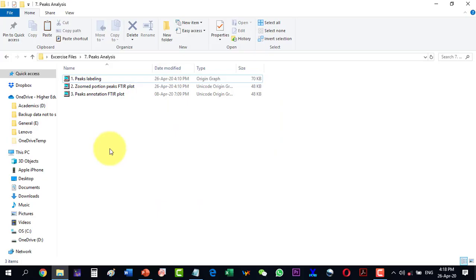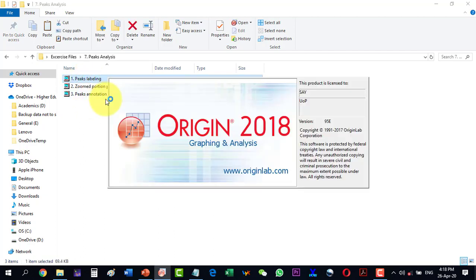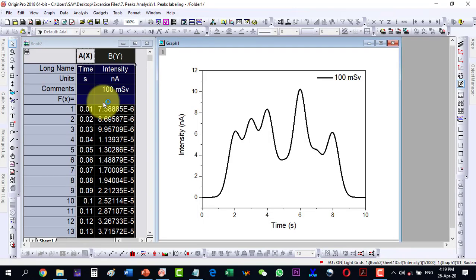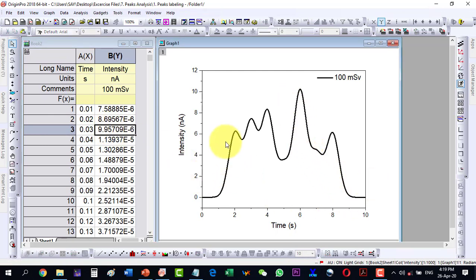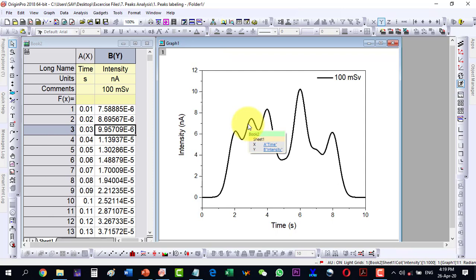In this video we will talk about how to find peaks in a given plot and how to label them. Here the plot is based on two-column data and is having many peaks in it. One way we do the labeling of these peaks manually, and another way is to do it automatically with the help of Origin.